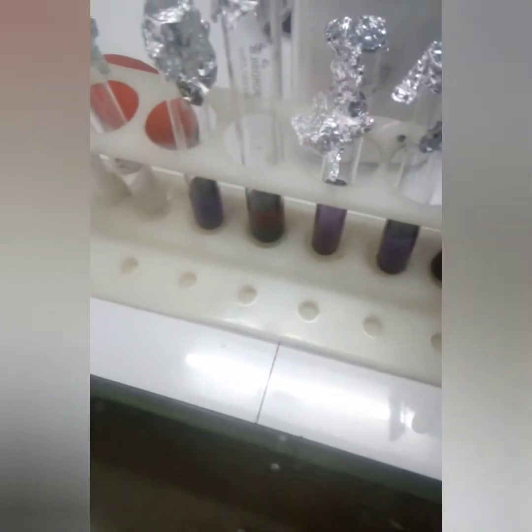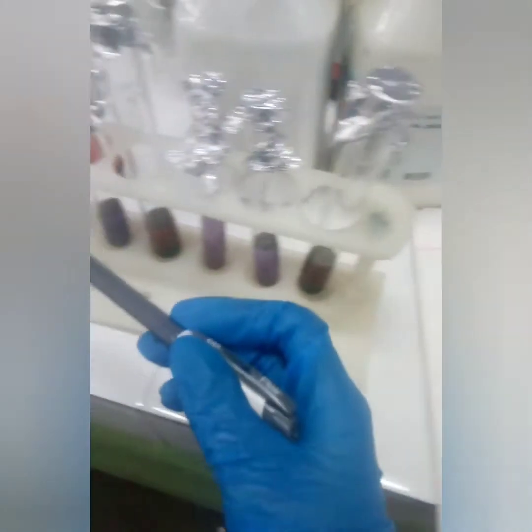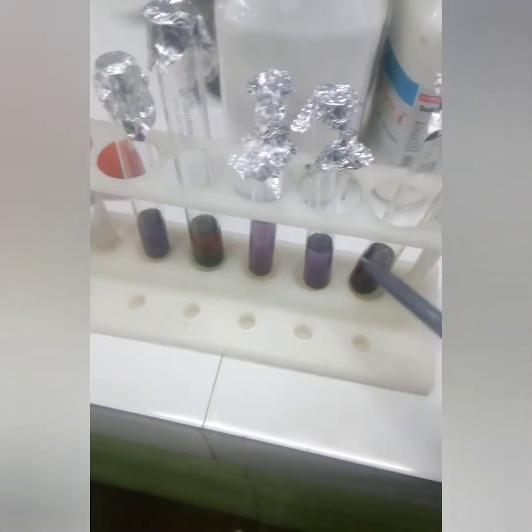Now next, after taking the different concentrations of the amino acids, we will make the final volume of all of these to 4 ml by adding water.